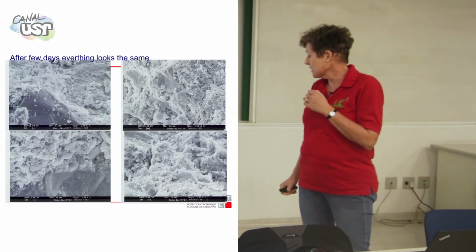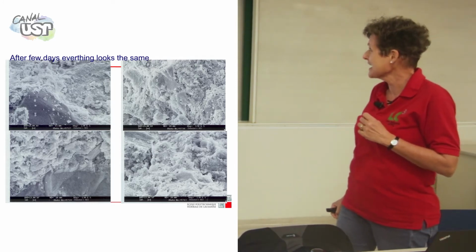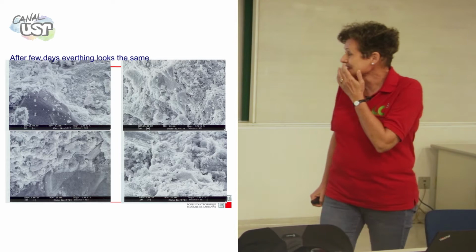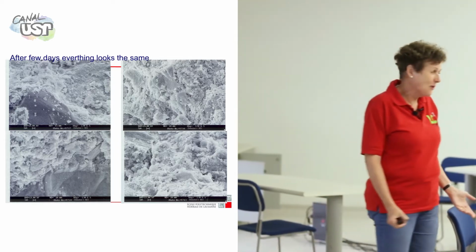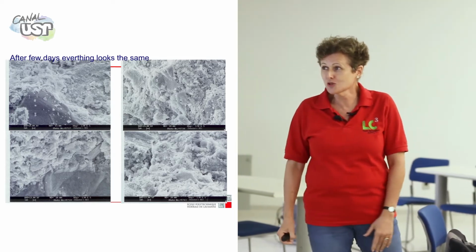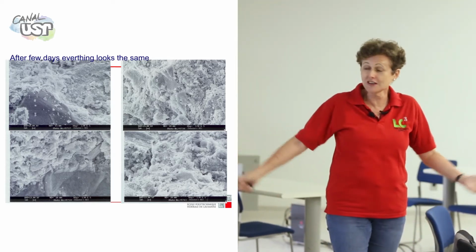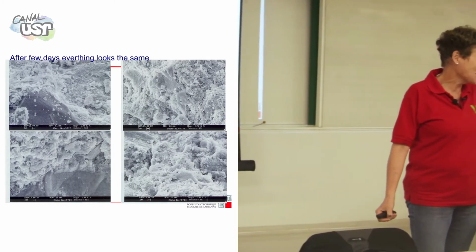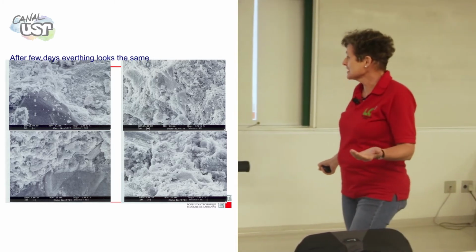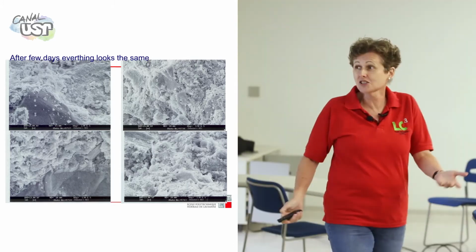And unfortunately, this is an example I took from a paper. I won't tell you what paper. I can't even remember what now, and I hope the person who wrote that paper never finds out that I did this. But this is a typical example of somebody claiming to have done some useful scanning electron microscopy. And these were supposedly 4 different samples. And these images are telling us why these samples are different. Well, I mean, you know, it's a joke.